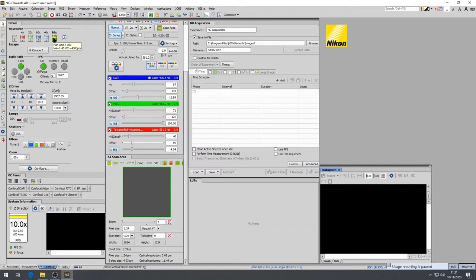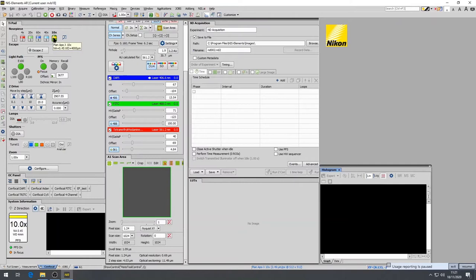Click the refocus button on the right side of the body to bring the sample to approximate focus. Be careful not to touch the objective to the cover slip or sample stage if an oil immersion objective is used. Raise the objective until you observe the oil touching the cover slip. At this point, you are close to the focal plane.